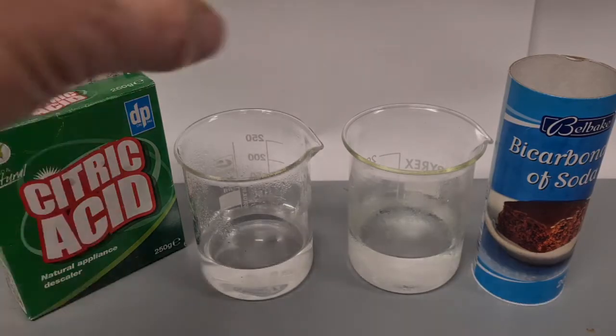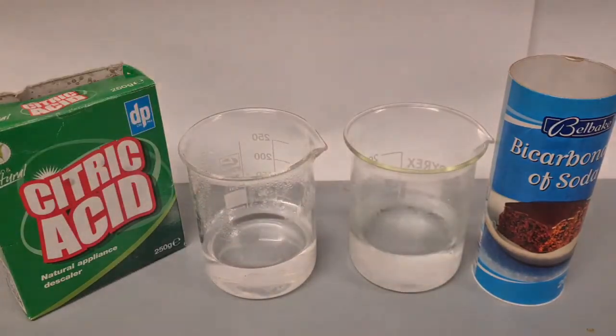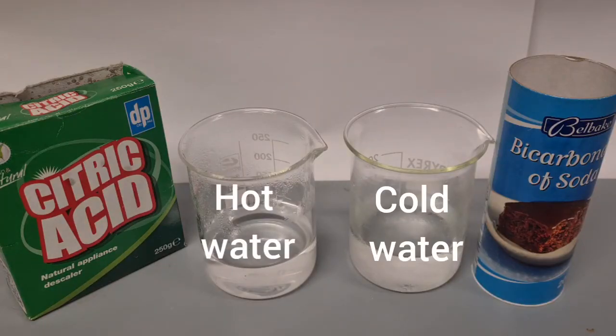I have two solutions here. This contains hot water straight from the kettle, and this contains cold water from the fridge. We want to observe whether there is any difference in reaction rate when both liquids are at different temperatures.